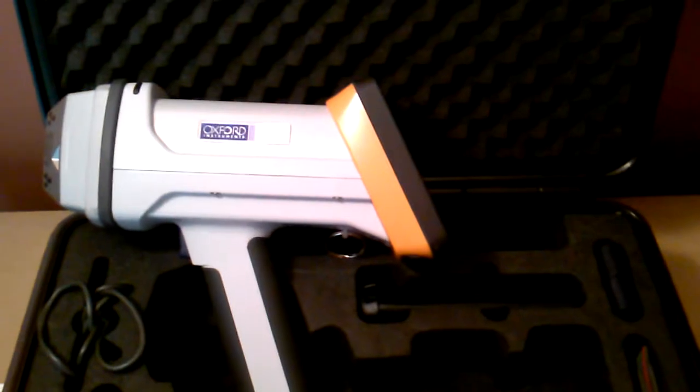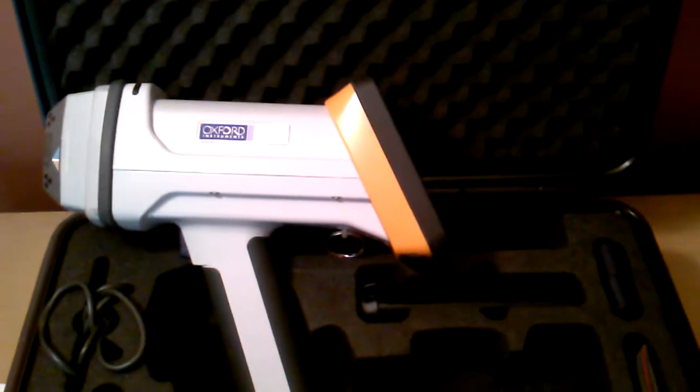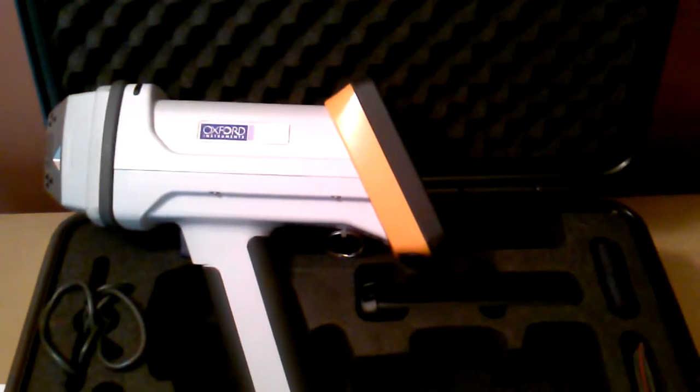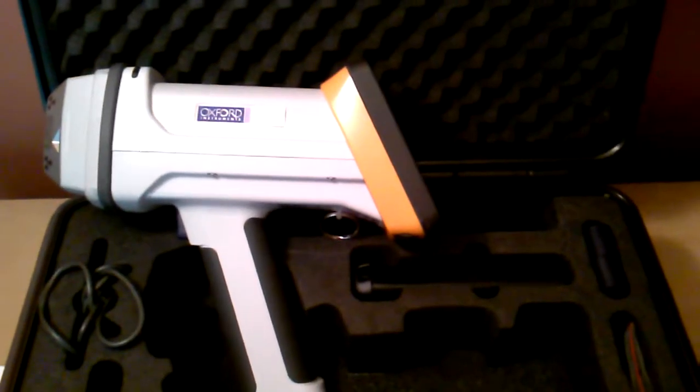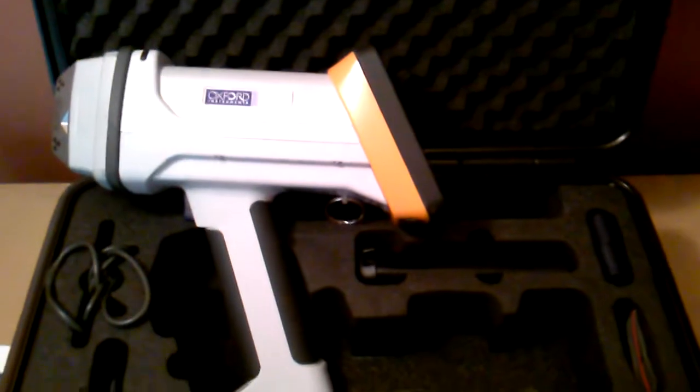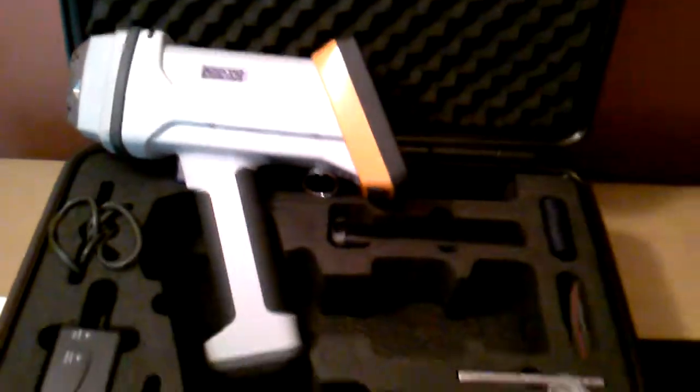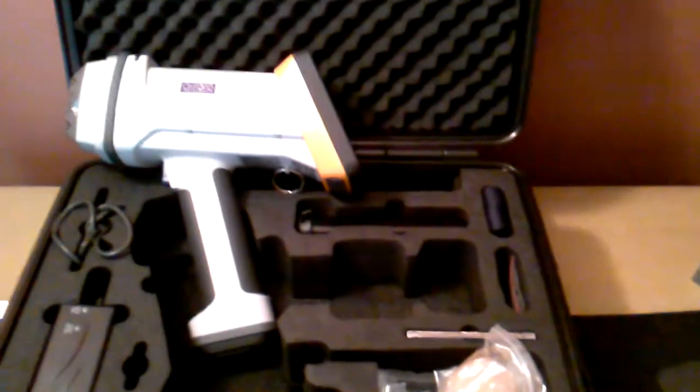We're going to get that started up, show you how the software and report generation capabilities are on the handheld XRF analyzer from Oxford Instruments.